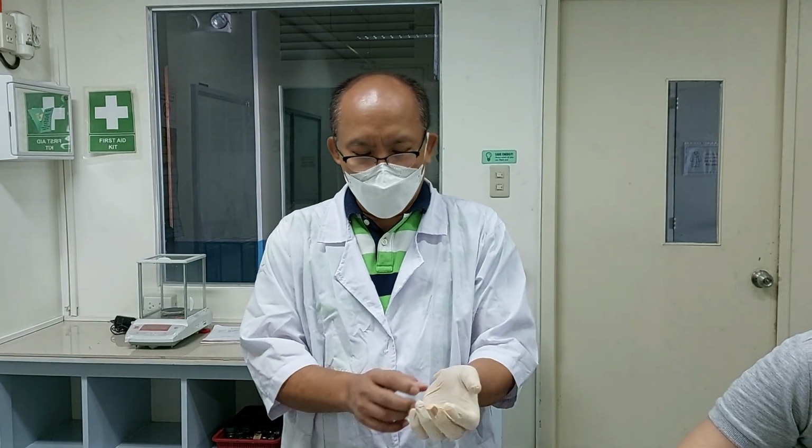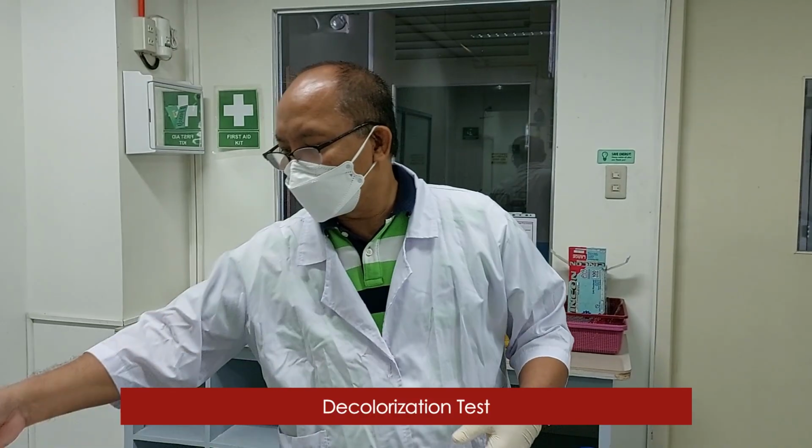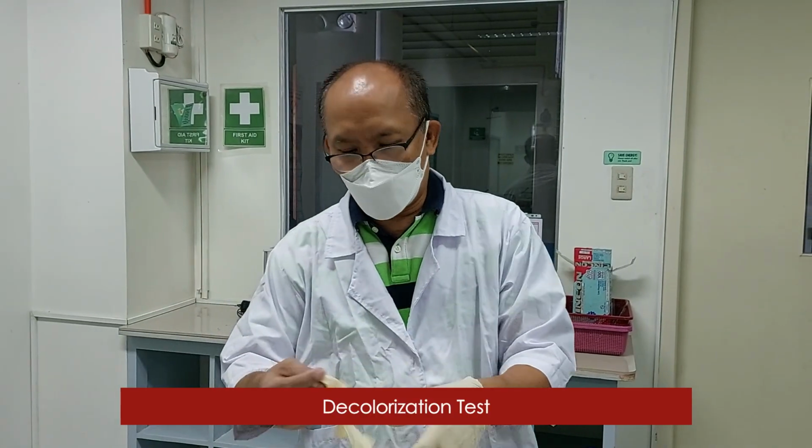So when bromine reacts with alkene or alkyne, the product is alkyl halide. So the bromine is integrated in the alkene and alkyne, forming alkyl halide. So what will happen to the color of the bromine? It will disappear. That's why the test is called decolorization test.